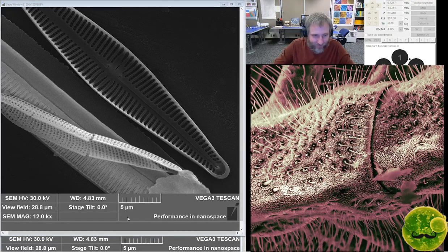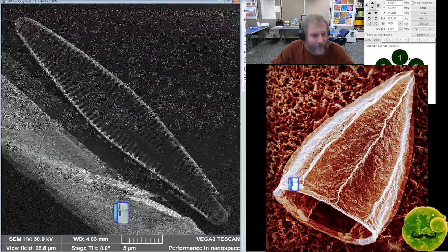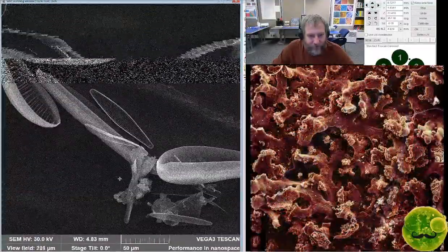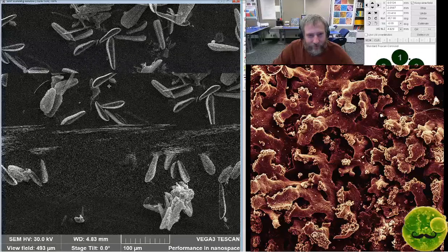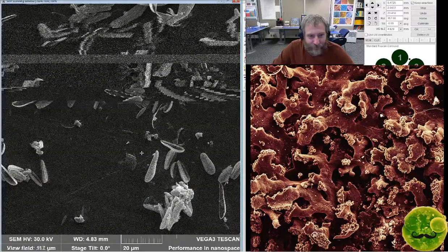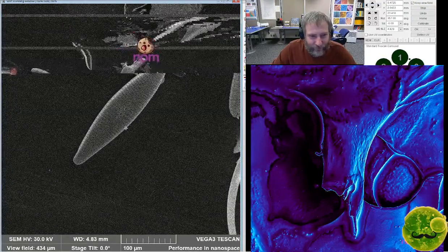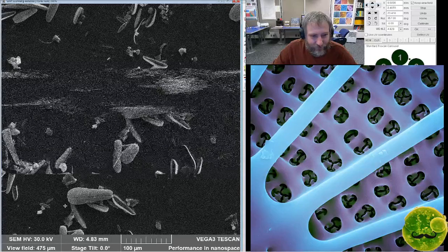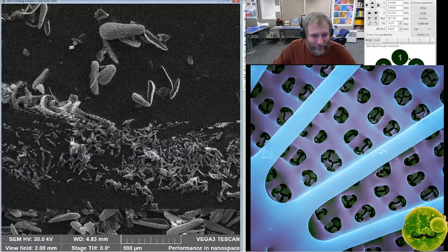Internal large. Oh, I need some more external views and then we'll be in good shape with this one. Let's see, I'm sure I can find some. It's a common diatom in here, which is nice because usually I have to hunt around forever to find something. This one's right here. That's a small one. I want a bigger one. I get greedy. What's happened? This is where the droplet was.